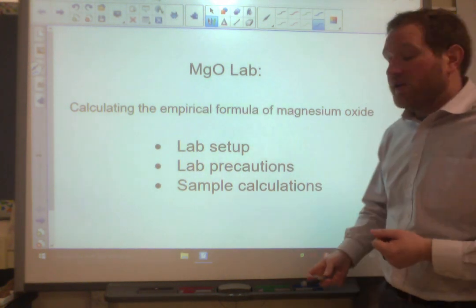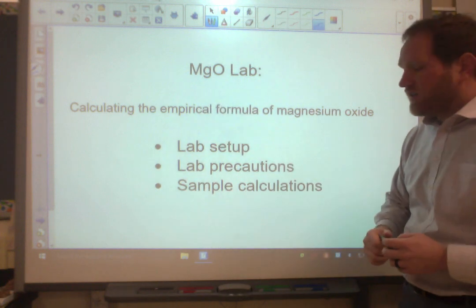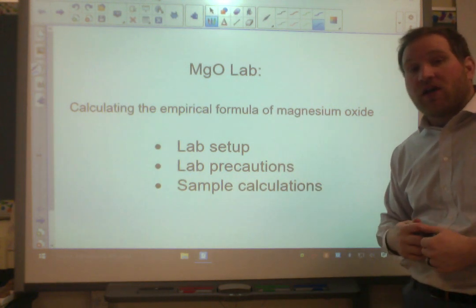Hi everyone, in this video I'm going to be talking about the MgO Lab, magnesium oxide lab, more specifically calculating the empirical formula of magnesium oxide. So I'm going to go through the lab setup, lab precautions, and sample calculations.